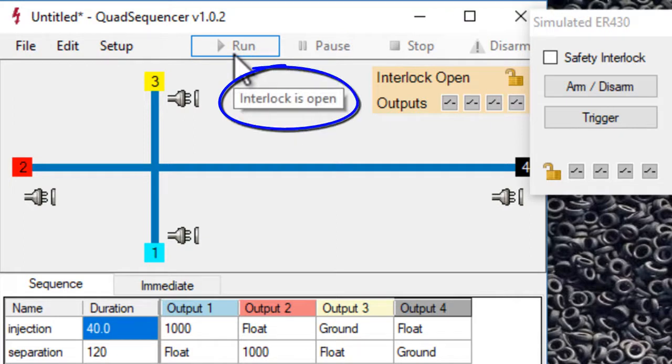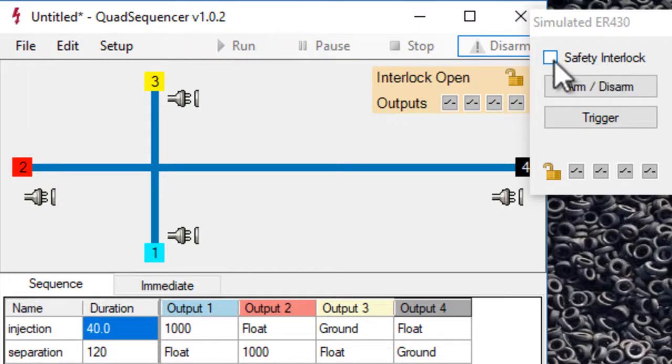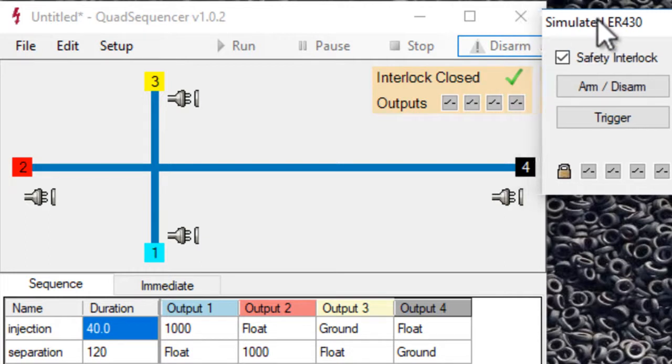The interlock is a safety feature to protect users from getting a shock. We can close the safety interlock by clicking here. It's going to say interlock is closed.